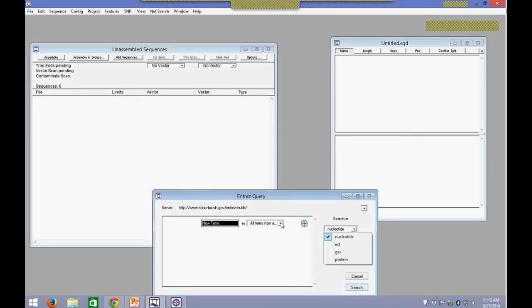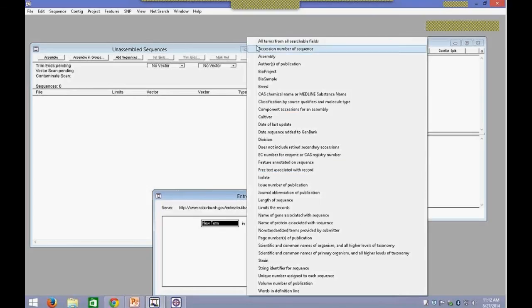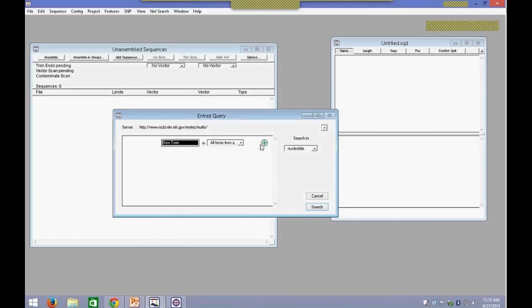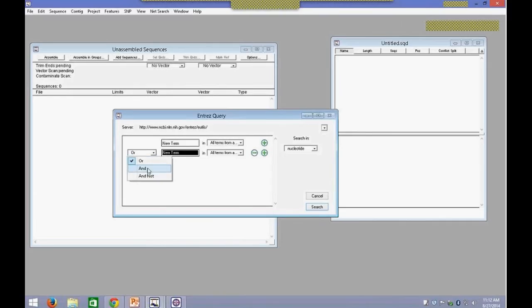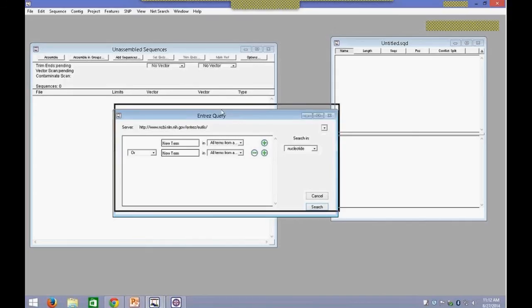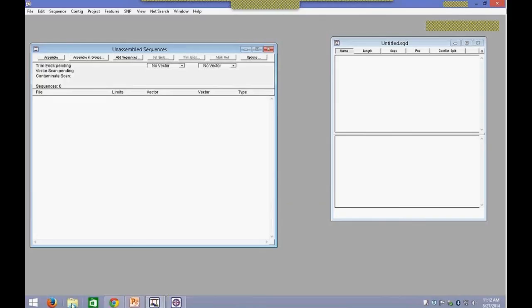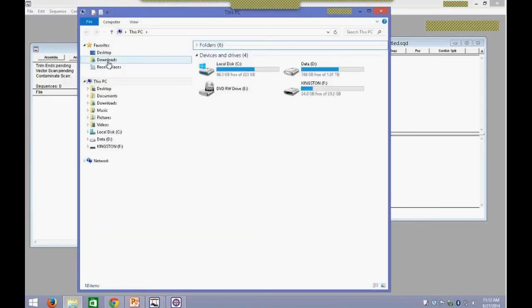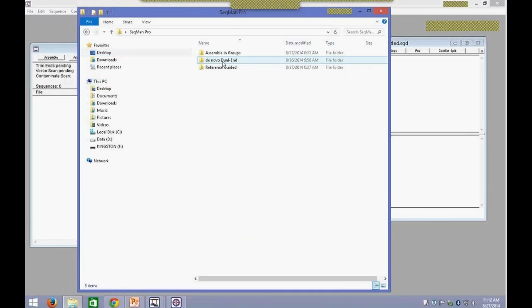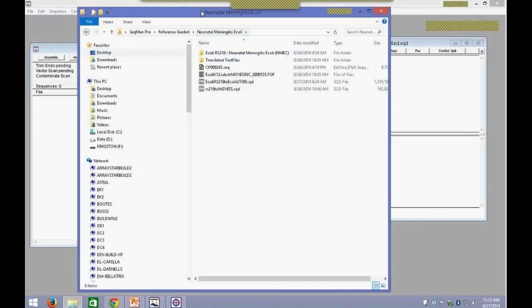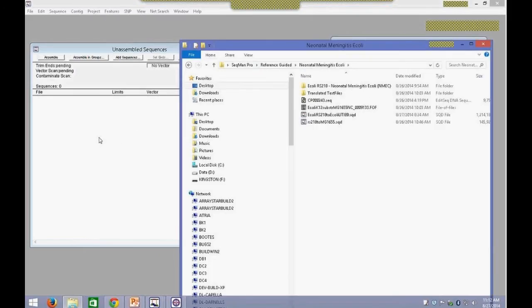You can also go into NetSearch and do a new text search — this could be any generic term or keyword in any of the publications. It will connect to NCBI databases, Nucleotide by default, but you can change it to any one of these that you prefer. You can also further filter based on the type of term that you're searching and apply multiple filters with OR, AND, and NOT options. One method I prefer is drag and drop — you can browse to your folder of interest and drag and drop your data right into the Unassembled Sequences window.